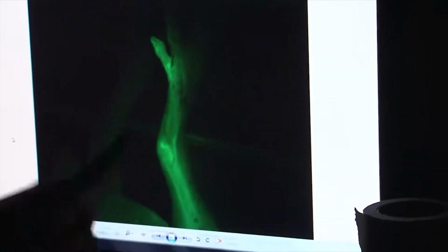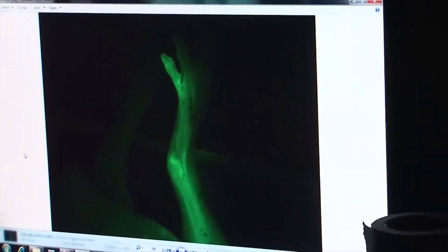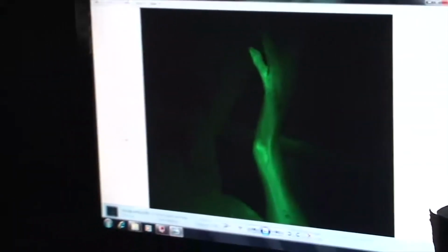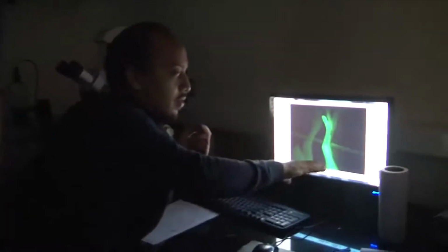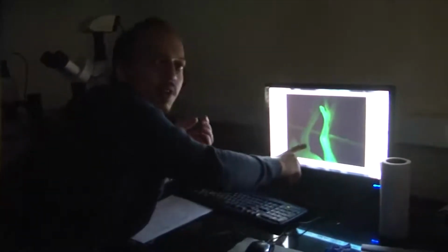But if you let it stay on for a longer time, like this is a day 8 embryo. So this was the limb in which I had incorporated the RCAS GFP. It's a viral vector with green fluorescent protein along with it. Because it's a virus essentially, it spreads along the limb. And now the entire limb which I had electroporated has a fluorescent green label. As you can see, this is the green limb, and this one is the other one which doesn't have any green fluorescent protein.